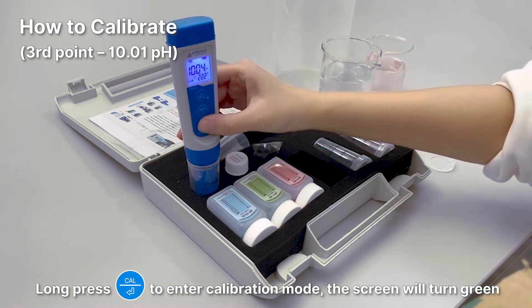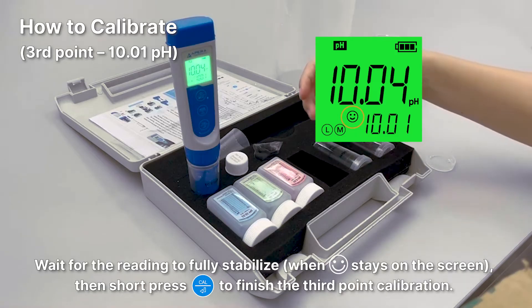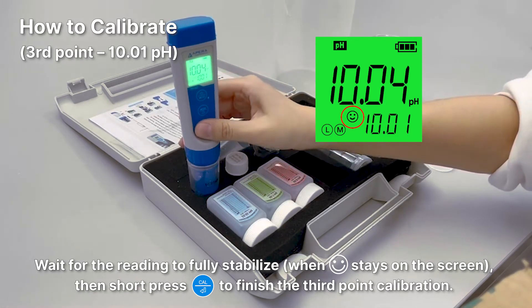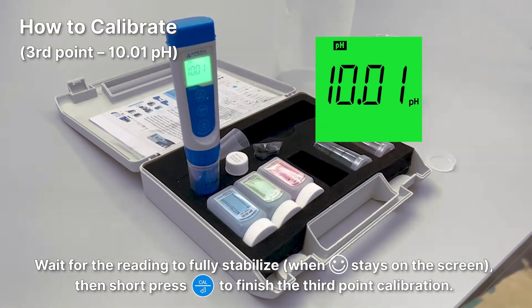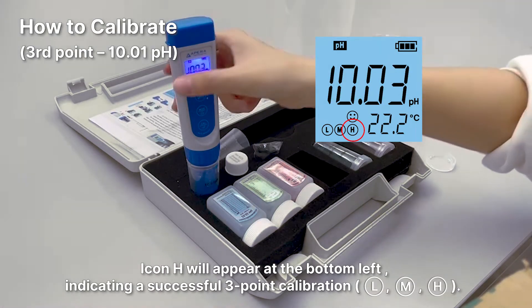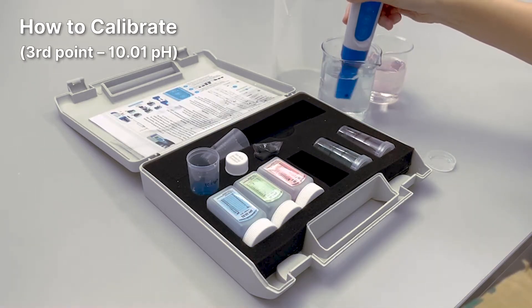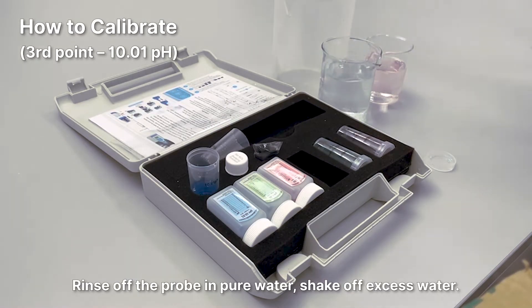Long press the CAL button to enter calibration mode — the screen will turn green. Wait for the reading to fully stabilize, then short press the CAL button to finish the third point calibration. Icon H will appear at the bottom left, indicating a successful three-point calibration. Rinse off the probe in pure water and shake off excess water.